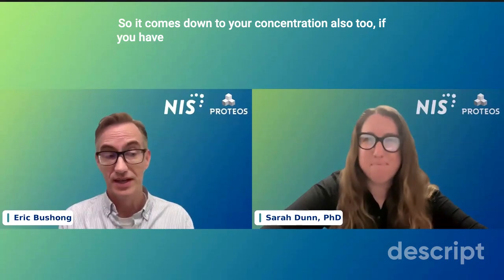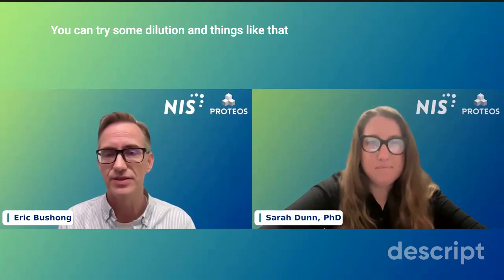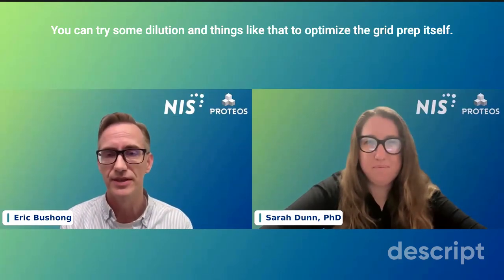So it comes down to your concentration also. If you have just a lot of particles, they have nowhere to go. You can try some dilution and things like that to optimize the grid prep itself.